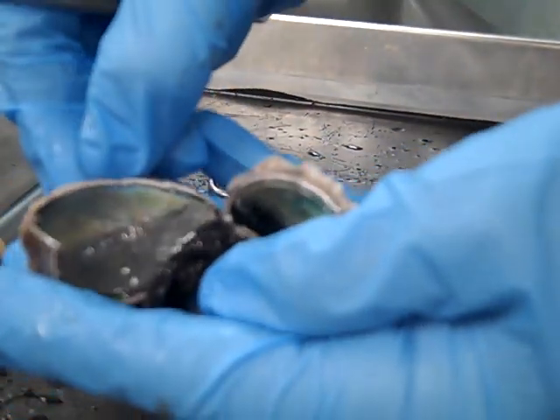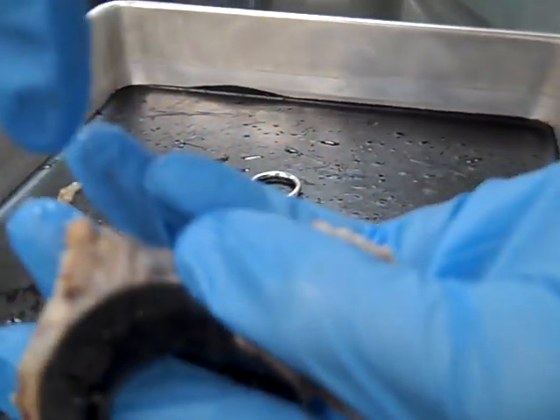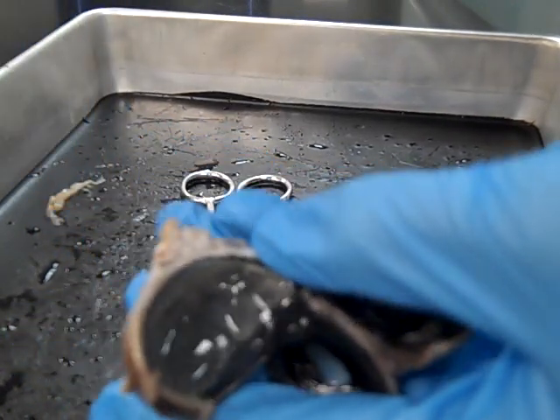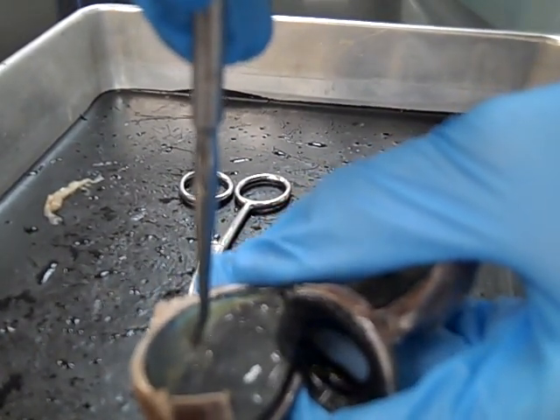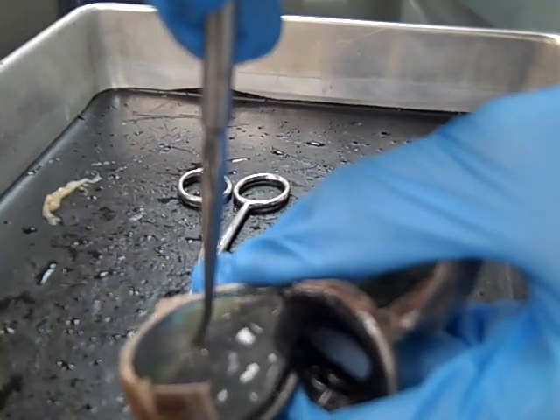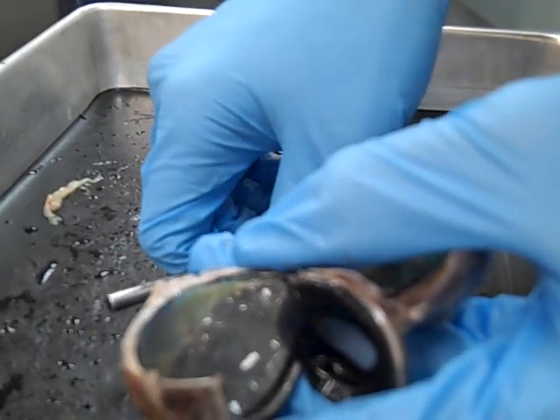If you look at the retina right behind the optic nerve — the optic nerve is right here — just inside here, opposite the optic nerve, you will see the blind spot. That's where the retina attaches to the optic nerve.